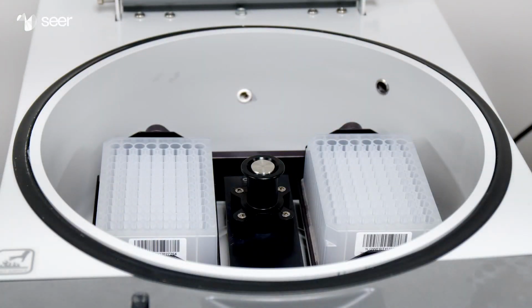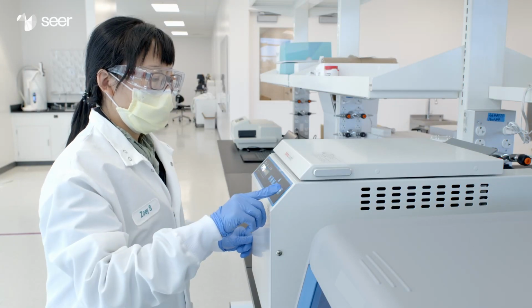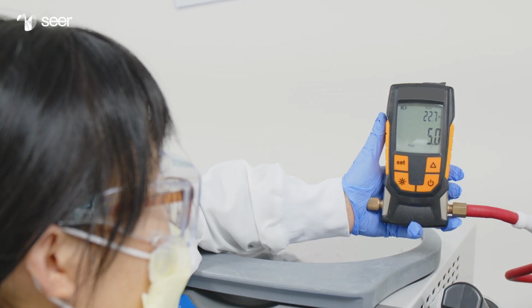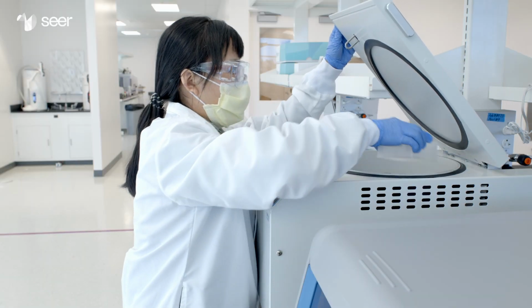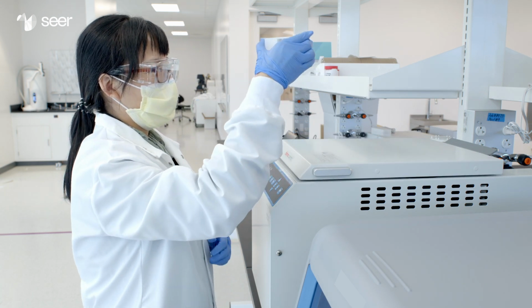Confirm the vacuum concentrator is appropriately balanced. Set the temperature to 20°C or lower. Do not walk away from the vacuum concentrator until efficient vacuum has been established. Run the vacuum concentrator until the peptides are fully dried, which can take several hours. We recommend running the vacuum concentrator overnight. When the vacuum concentrator is finished, visually confirm the peptides are fully dried.